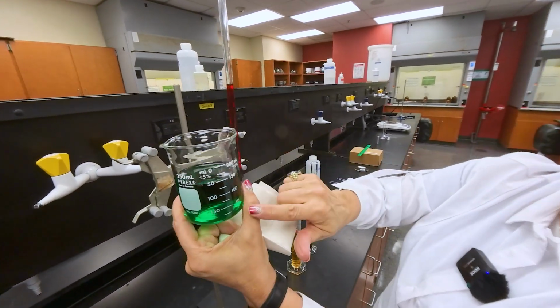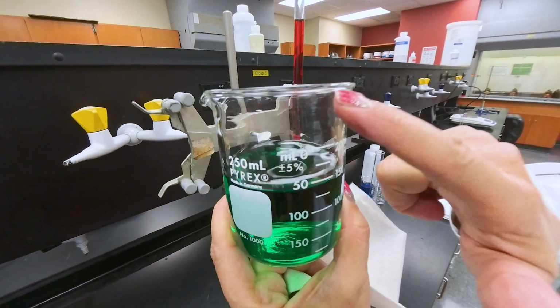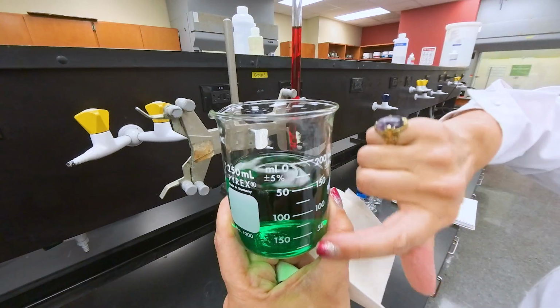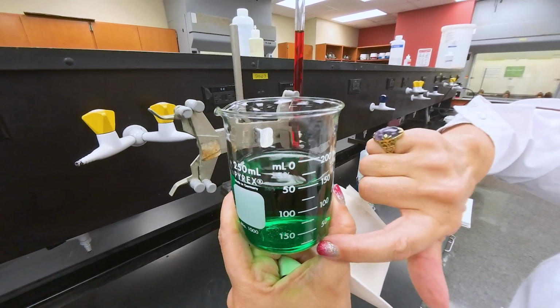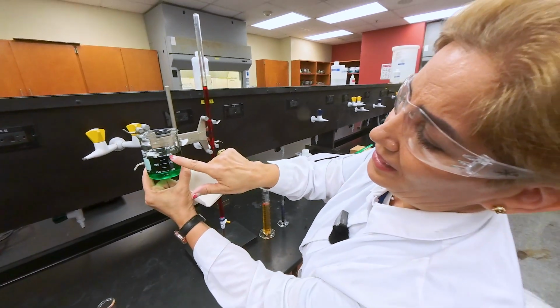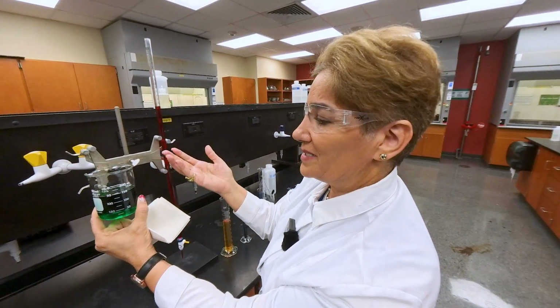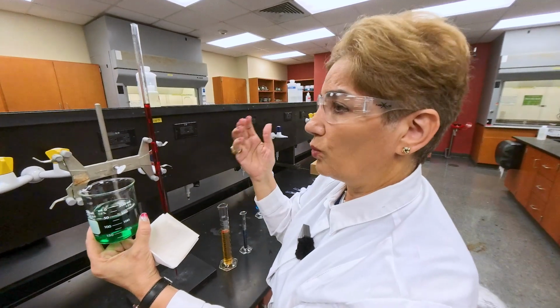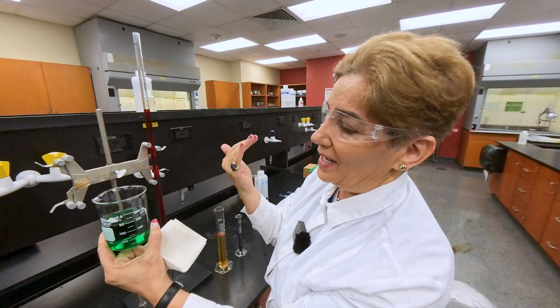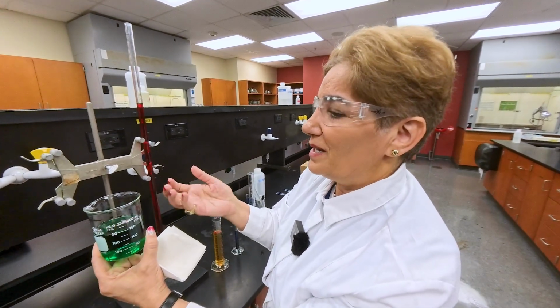For this approximate volume, pay attention to the side, increasing and then decreasing. This is how much you transfer out. This is how much liquid is in the beaker. So if I look at the number on the right side, it shows me about 150. Now, if you tell me it's like 150.1, yes, it looks very fancy, but it's not ethical, because this device doesn't give me 0.1.